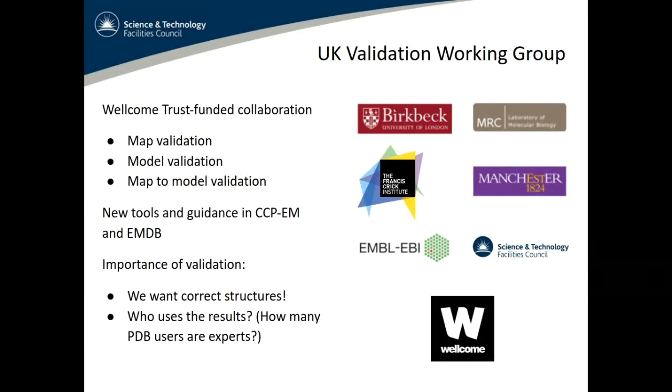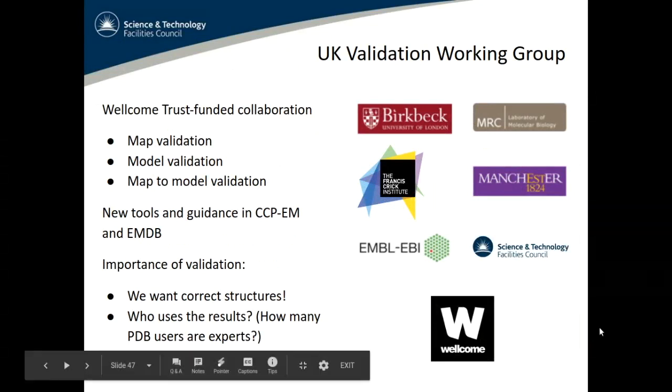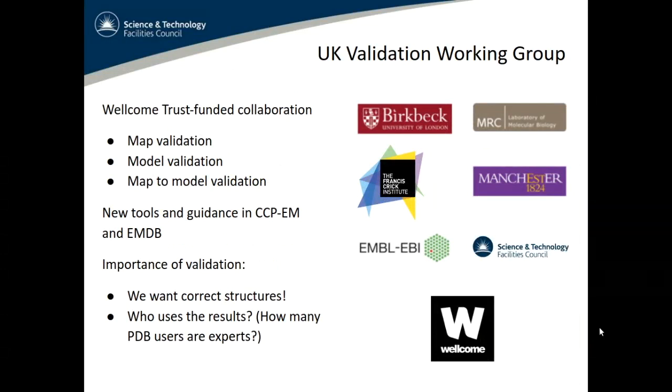The other thing I think we should bear in mind is who is using these results. There's an interesting figure we found out recently about the number of PDB users who are actually expert structural biologists, and it's a fraction of a percent. So the data we put in there, as structural biologists, we probably know to be a bit cautious in approaching it, to look at the raw data, consider whether it's likely to be correct. But a lot of the people who are using the PDB treat these data as perfect, and they will just use the models and assume they're correct. So it is a responsibility on us as depositors of structures to make sure they're as good as we can get them.